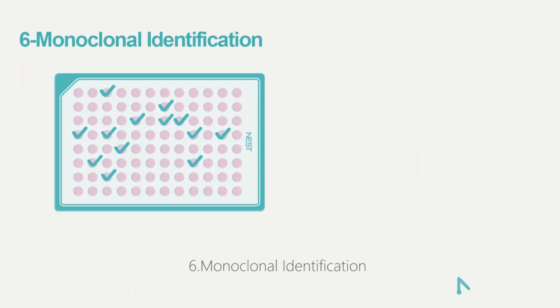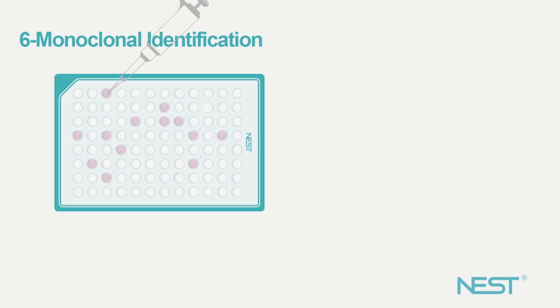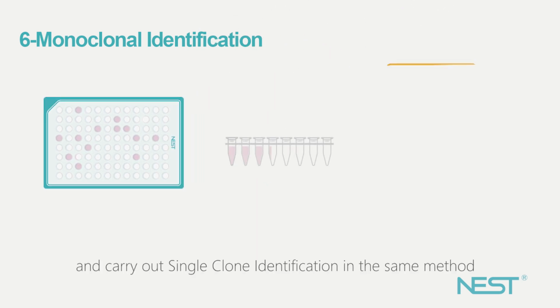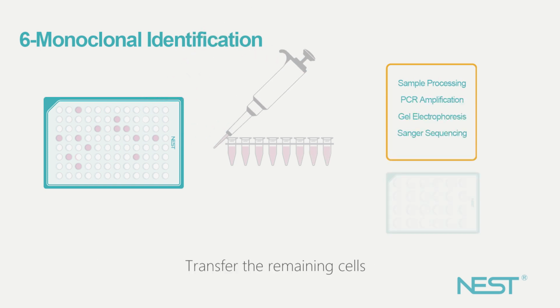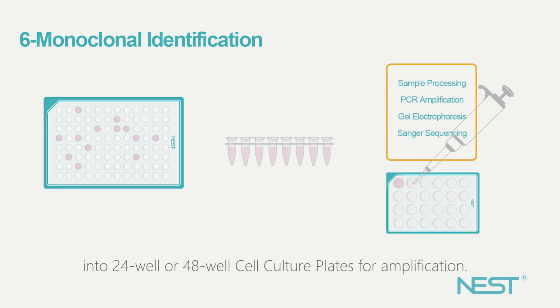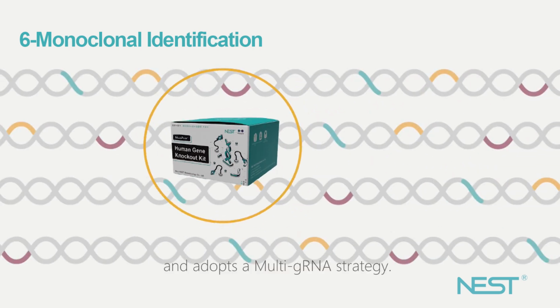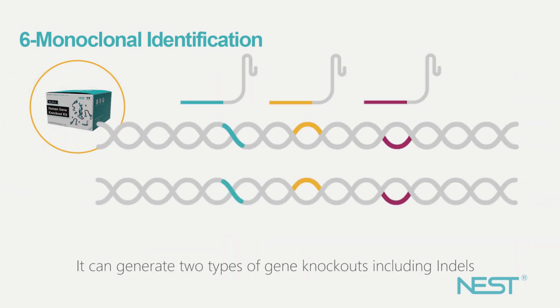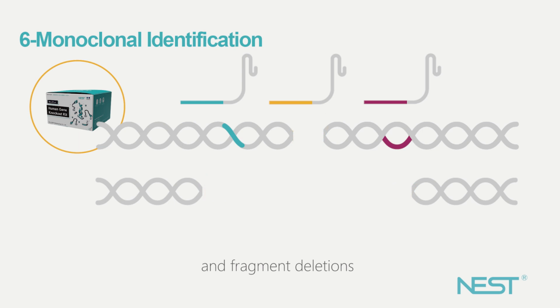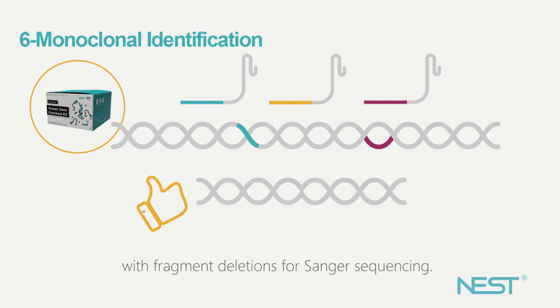Sixth, monoclonal identification. Digest the monoclonal cell colonies in separated wells respectively and turn them into single-cell suspensions. Take 1/3 of the cells and carry out single clone identification in the same method as the mixed clone identification. Transfer the remaining cells into 24 well or 48 well cell culture plates for amplification. The QuickKO Human Gene Knockout Kit targets coding genes and adopts a multi-guide RNA strategy. It can generate 2 types of gene knockouts including indels and fragment deletions, and will preferentially select single clones with fragment deletions for Sanger sequencing.